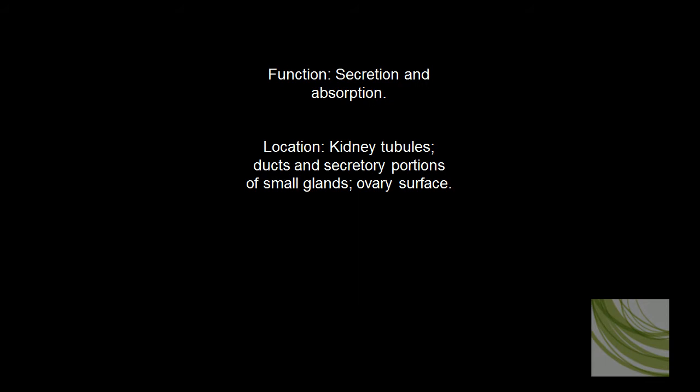These are two different slides of simple cuboidal epithelial tissue. The function of simple cuboidal is secretion and absorption, and we find it in places like the kidney tubules, ducts, any type of secretory portion of small glands, and on the surface of the ovary.